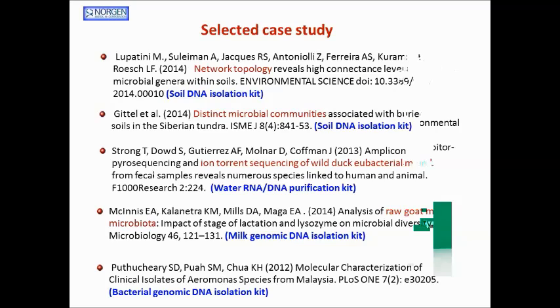Another aspect I would like to bring up here is the importance of sample collection and preservation. 16S rRNA sequencing is significantly influenced by the population of each microorganism group in the sample. If the population is affected by the sample collection or transportation method, which is sensitively affected by temperature or the duration of transportation, the result will be quite far from the original sample.